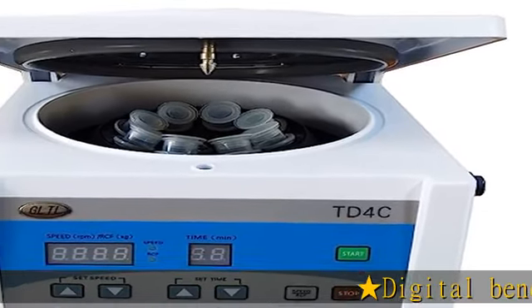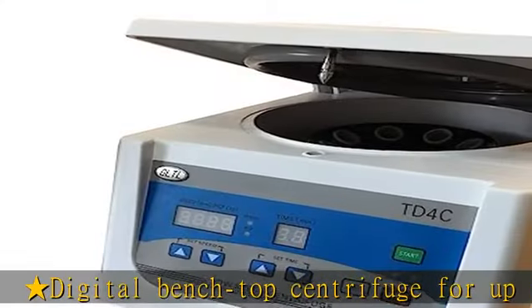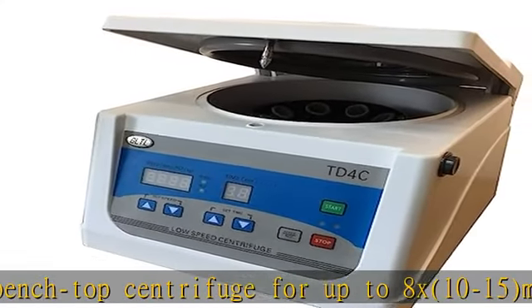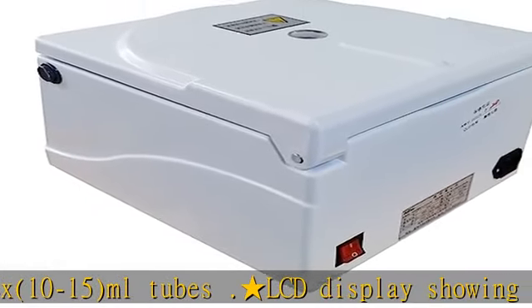Digital Benchtop Centrifuge for up to 8x 10-15 mL tubes. LCD display showing time, 20 seconds to 99 minutes, and speed, 100-4000 RPM, up to 2200 XG.